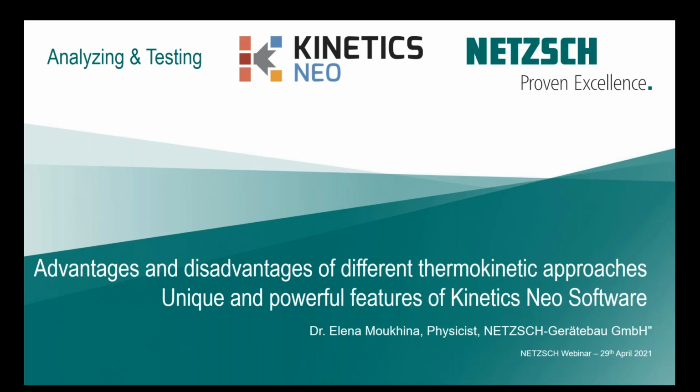So, hi everybody. I think you see my screen. It should be green with the NETZSCH logo and with our title, Advantages and Disadvantages of Different Thermokinetic Approaches and Unique Features for Kinetics Neo Software.